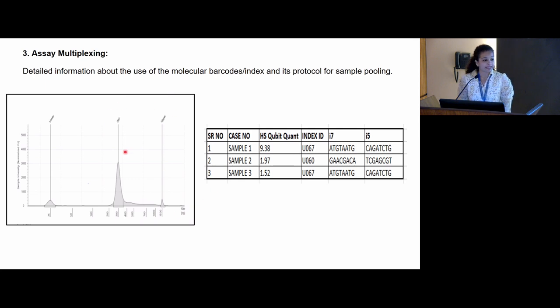Second is the library count and QC for how much the peak size is there. So if we want to sequence a 300 base pair paired-end library, our sequencing peak should come around 300 base pair. If there are some peaks before 300 base pair, they will take our read counts, and the allotment for the specific library reads won't be there.